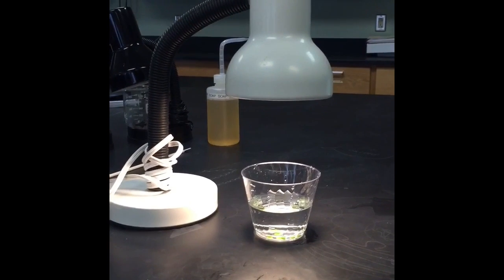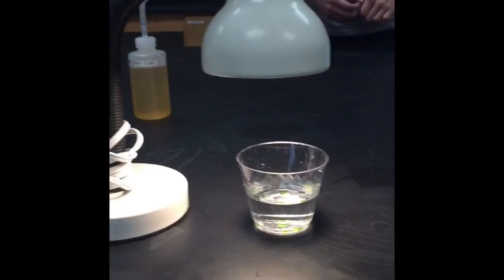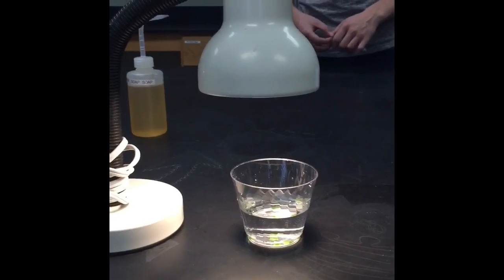Have just put discs under lid. We are at the 5-minute mark. Still no floaters. 6 minutes.